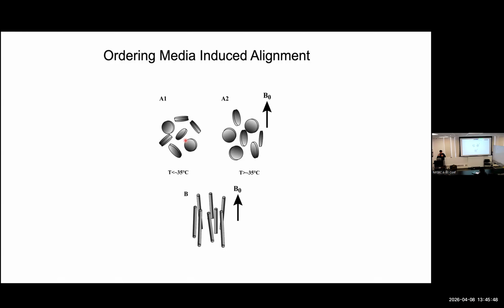So you think it's electrical charge. But am I applying an electrical potential in the sample? I have a magnetic field. You could apply it, but that would go back to the electrical approaches. So no, it's not electrical. What makes them align? Because remember, you have a magnetic field, they know. If you were to go and have a conversation with the aligned bicelle and say, hey bicelle, how are you doing? I'm doing good, how are you? Can you tell me where the magnetic field is? Yeah. Because I can look at them and say, oh, the field is perpendicular to your normal. So clearly the bicelles know where the magnetic field is. So what's causing their alignment?